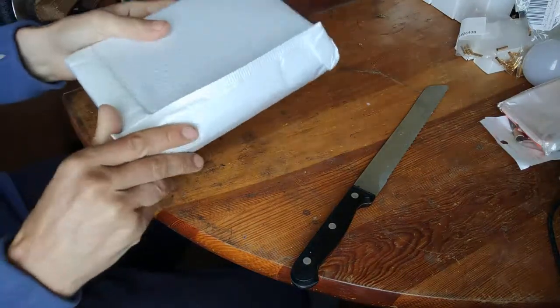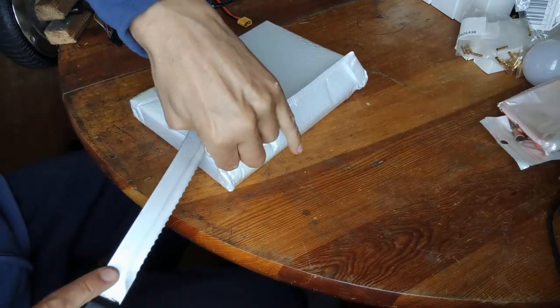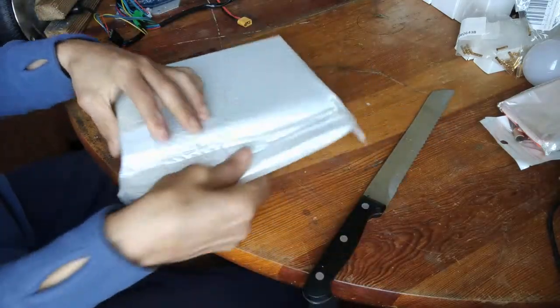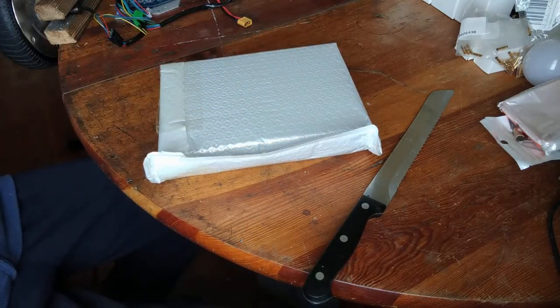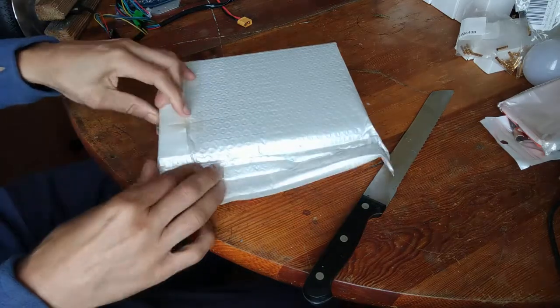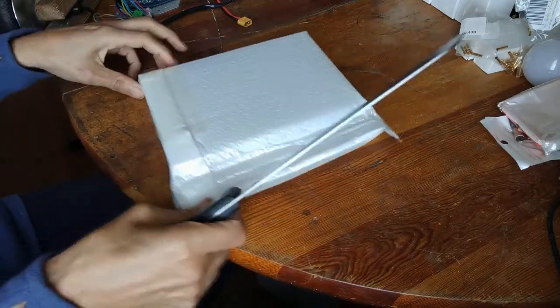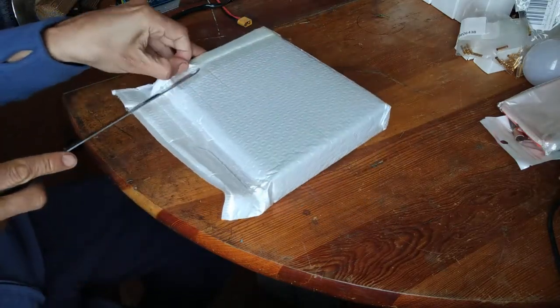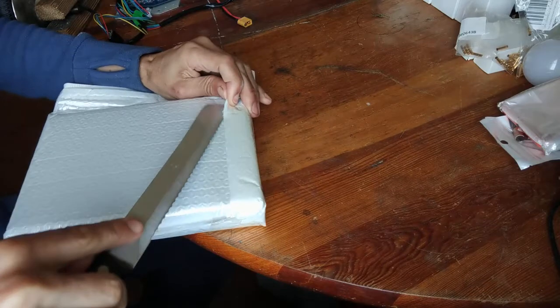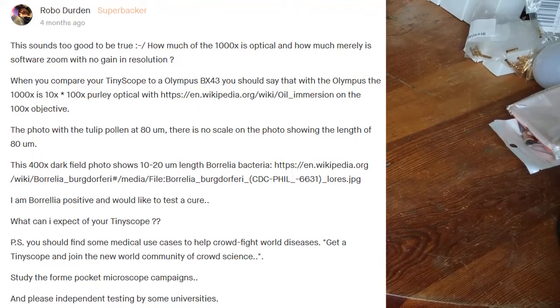Nice box. I think I forgot to cancel my pledge. Now people are complaining that 1000x magnification is never possible. But this is Kickstarter, not Amazon — you have to check the comment section to see what others say. I quickly agreed that this is not optical magnification; it's just what it looks like on the smartphone.